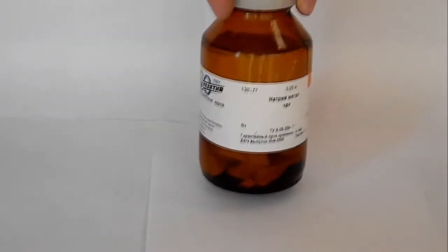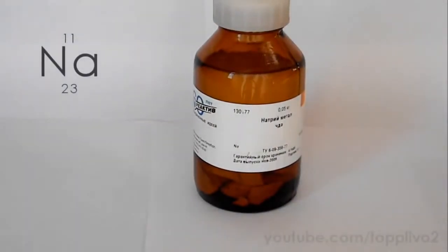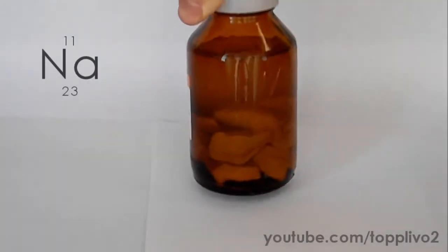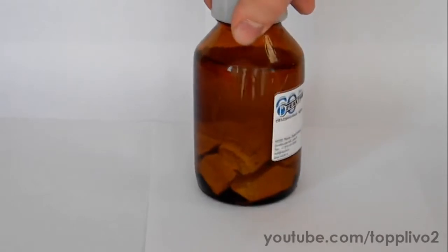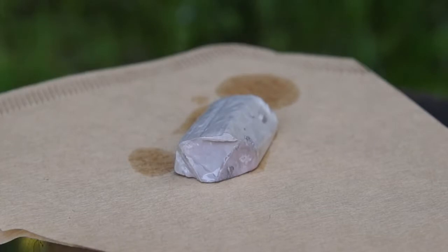Please note that this video was made solely for demonstration purposes. Do not attempt to repeat the experiments shown in this video. Hello everyone, today we'll conduct various reactions with the metallic sodium. I finally managed to buy it, so I expect this video to be quite interesting. As you can see, sodium is stored in kerosene in such a jar. We need to take a piece of sodium and put it on a filter paper to soak the remaining kerosene.